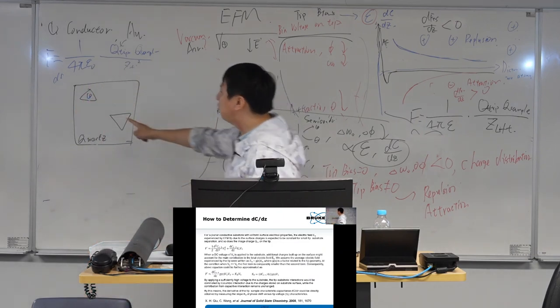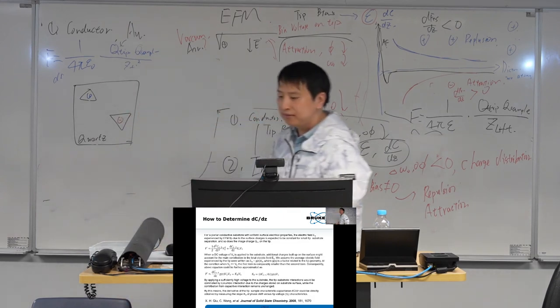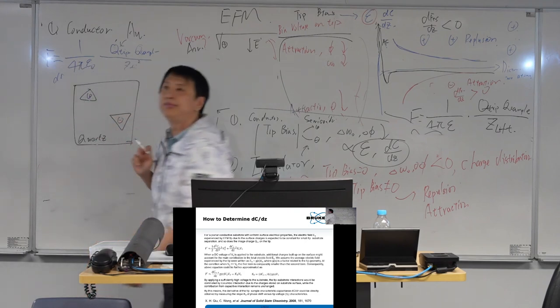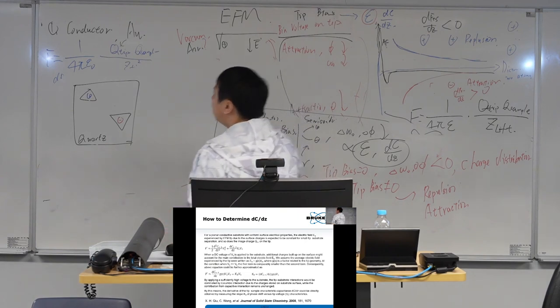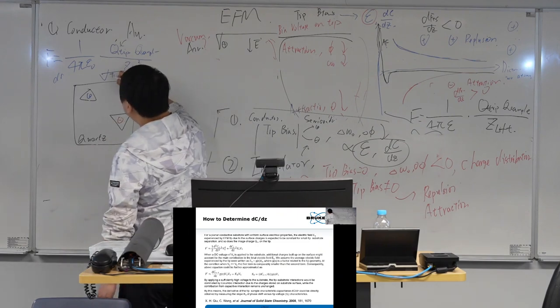And this graphene, I use my tip to inject some negative charge. And then how I distinguish these two, right? That's some practical examples. And then I will get a tip and then make the tip bias positive.